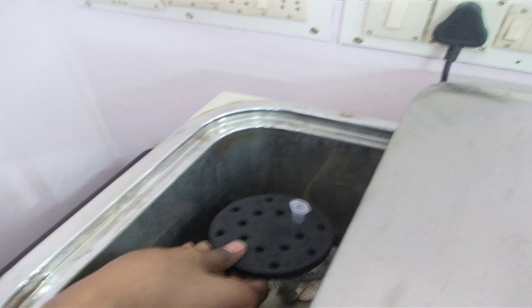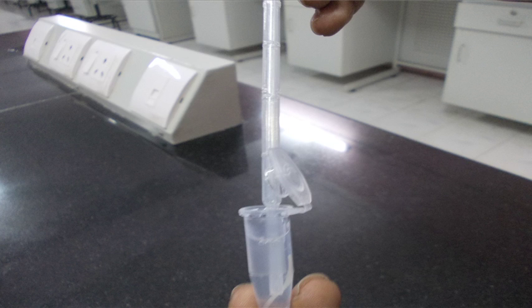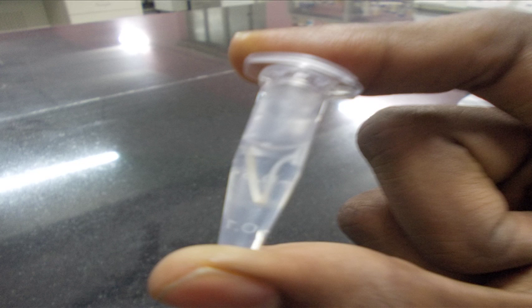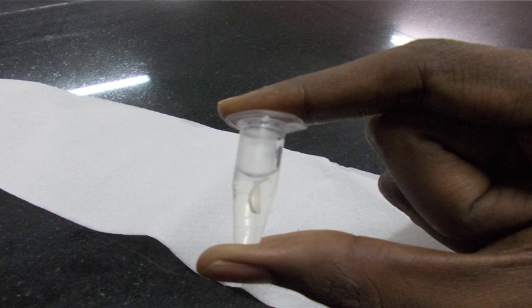After incubation, remove the tube from the water bath. Using the filler, draw the HCL and discard it in running water. Pour a little water in the Eppendorf tube. Close the tube. Shake it nicely. Draw water using the filler. Repeat the process three times.